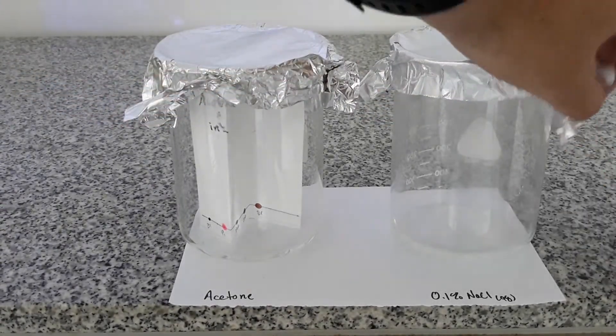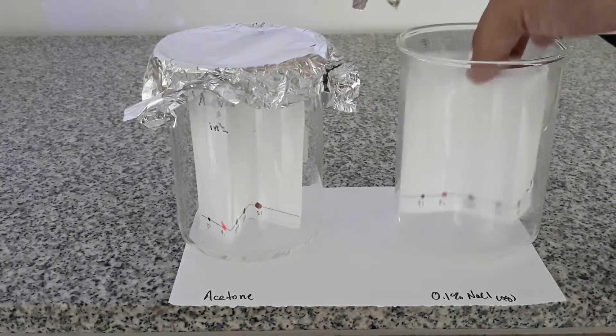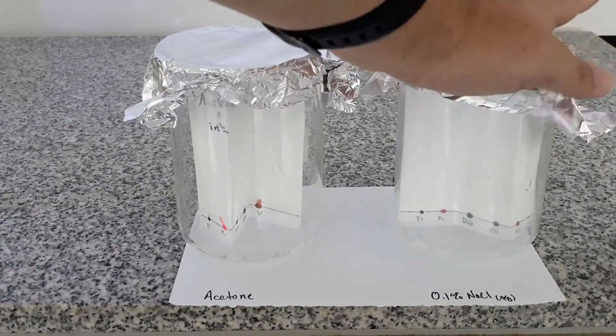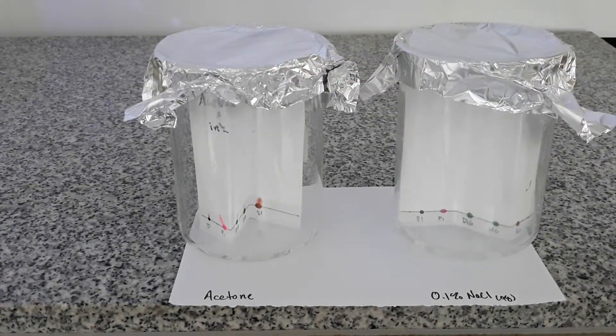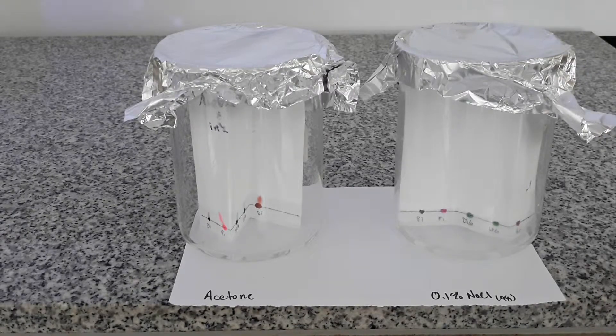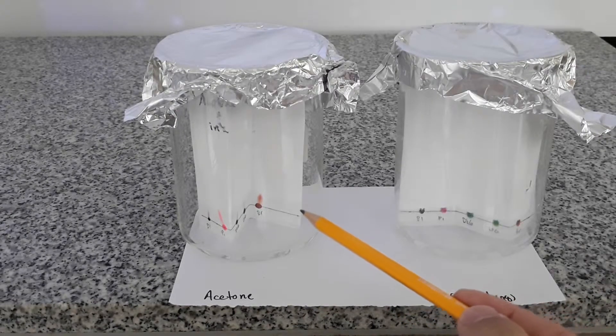You'll see that they will start to run pretty quickly. You won't have to wait around very long to see the colors start to separate. You can see acetone is already starting to separate the pink and the brown and the sodium chloride is just now reaching the start point.